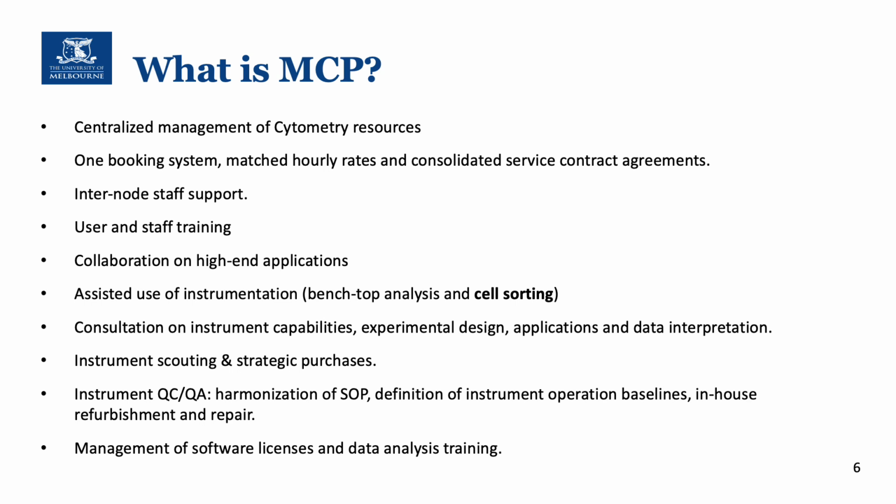We also manage the booking system, which is a unified booking system that covers all the resources that we have in the platform. We do a lot of inter-node staff support, so we typically work with each other, trying to solve problems and help users, and assist nodes that are not staffed. We also deal with user training and collaborations with users for high-end applications.